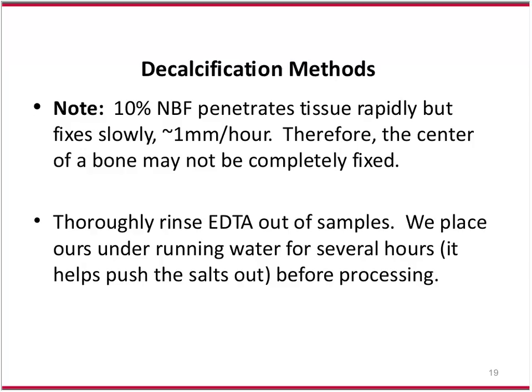You should thoroughly rinse EDTA out of all of your samples. We place ours under running water for several hours. And as long as your samples have been fixed proper, this isn't a problem. You know, nothing swells, but they have to be fixed a good amount of time in order to do this process of running water. And we do. We run a rubber hose right off our spigot into our sample container and just let the water flow for probably at least 3 hours with samples before processing.